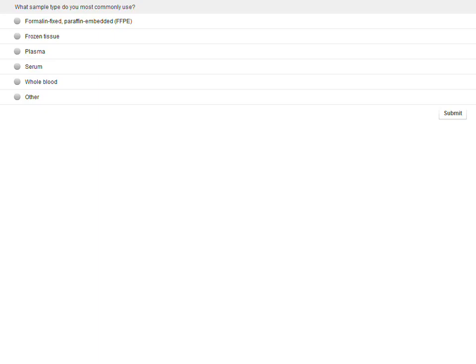So our first question that we'll be having is, what sample type do you most commonly use? Your selection of answers are formalin fixed paraffin embedded or FFPE, frozen tissue, plasma, serum, whole blood, or finally other.